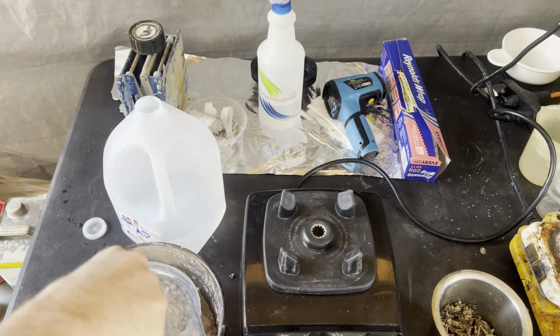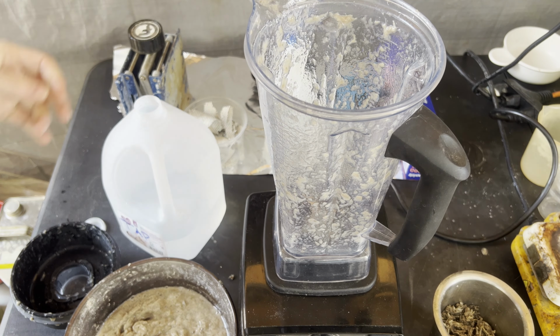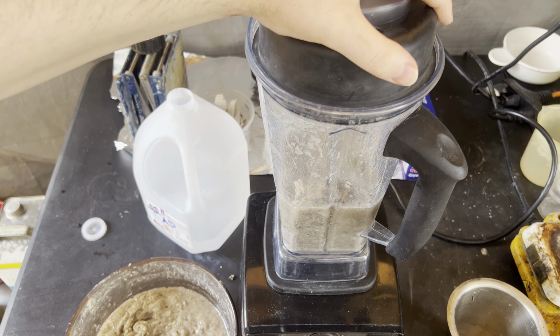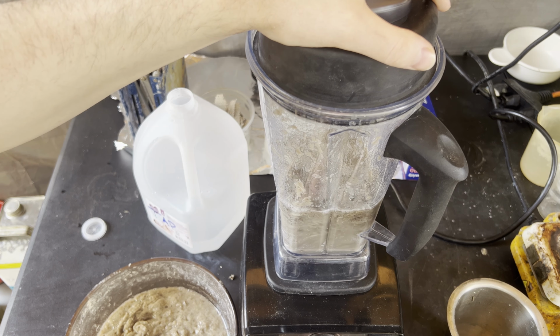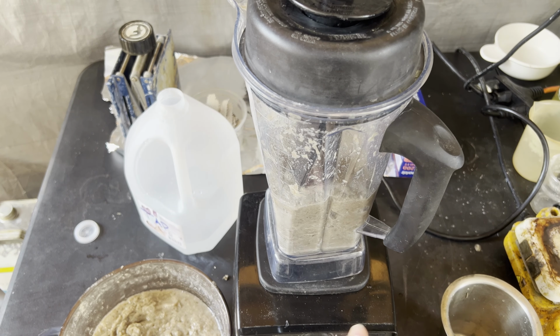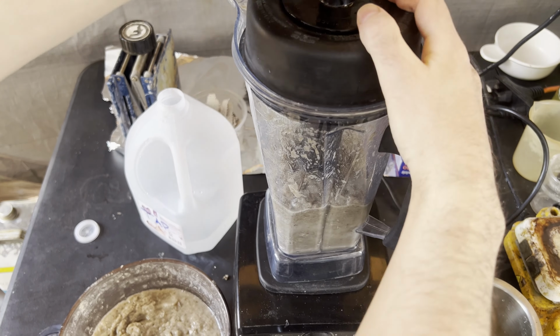I bought a bunch of asbestos cloth a while back, and I've used it to insulate whatever needs insulation in my lab whenever aluminum foil won't suffice. This includes beakers on a hot plate, for example, and sometimes solutions overflow and get the cloth wet. Depending on what the solution is, it can have next to no effect on the cloth if it happens once, but when it's something strongly acidic or basic, and/or if it happens multiple times, the cloth becomes brittle.